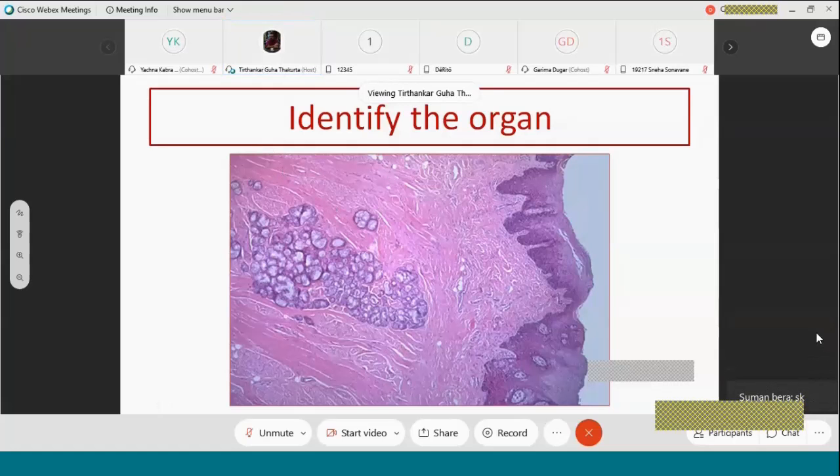Fine. So, now we are ruling out one by one. So first of all, it cannot be skin, because under the skin there should not be any muscle. It cannot be cervix, because there is no skeletal muscle under it. There is smooth muscle under it. It cannot be esophagus, because inside the esophagus you have layers of circular and longitudinal smooth muscle.